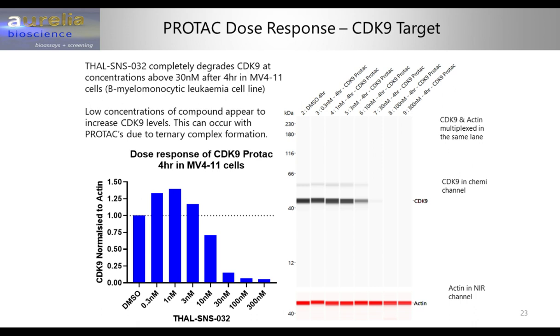Yeah, no, thanks, Hannah, you've stumped us. Sorry, guys. No, it's all right. I mean, PROTACs do have a tendency to do this sometimes, where there's almost not enough PROTAC potentially. It's binding in low concentrations, and it's almost blocking the protease inhibitor, the proteases, but not. I don't know. We're not quite sure, are we, with this one?